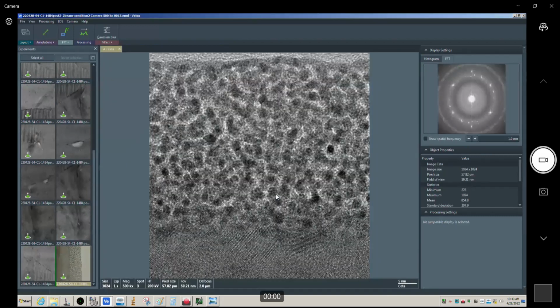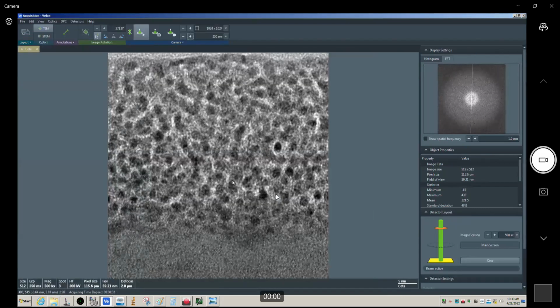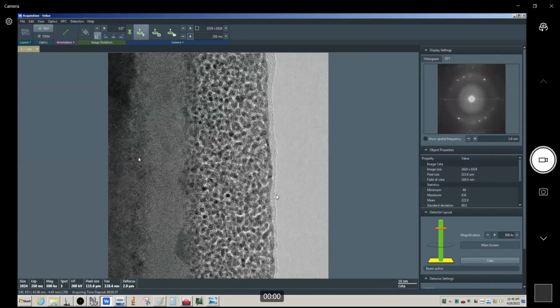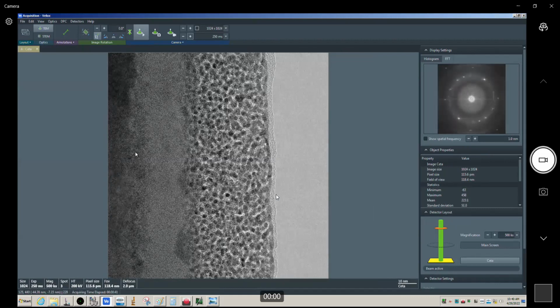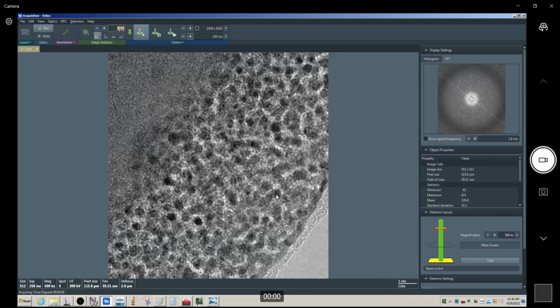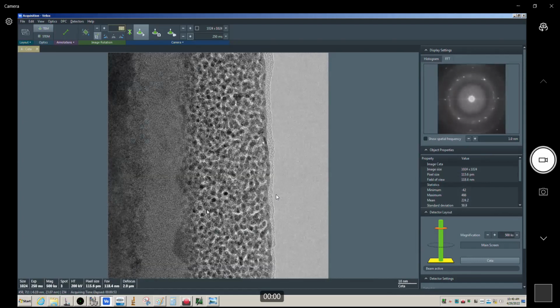So this is an option that you have. The only thing I ask you to do, when you're done, is zero it out. Otherwise, the next person is going to be really confused because he's expecting to see this, and he ends up seeing this, and he's going, why does it not look the same way? So again, make sure you zero it out if you choose to do that.